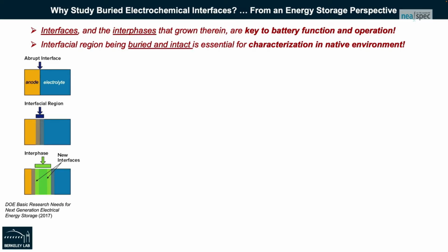Because of the central importance of the interphase, as new chemistries and technologies are proposed, there's an increasing need to characterize these interphases and glean a better basic understanding of how they function, because they're totally critical to battery success.